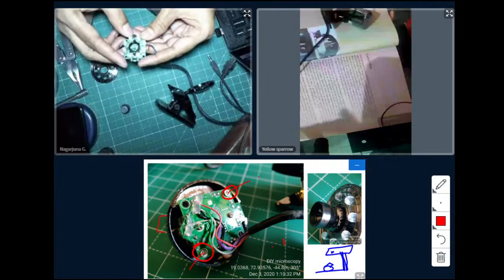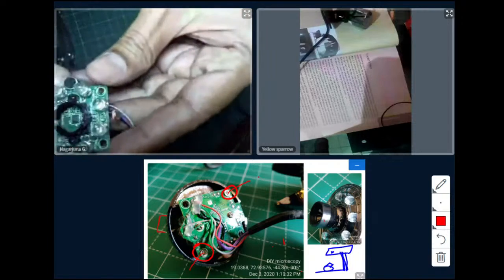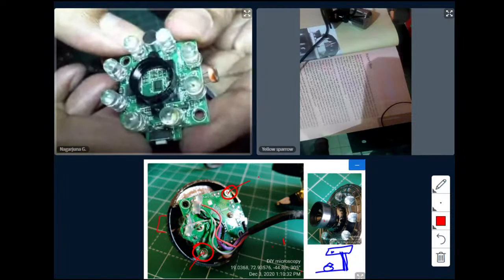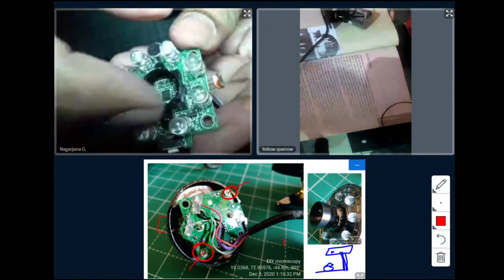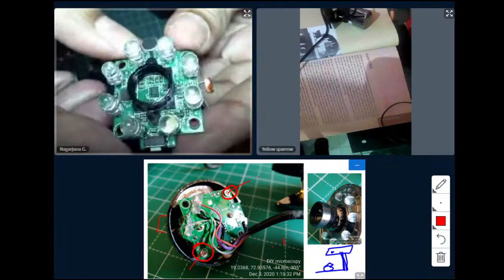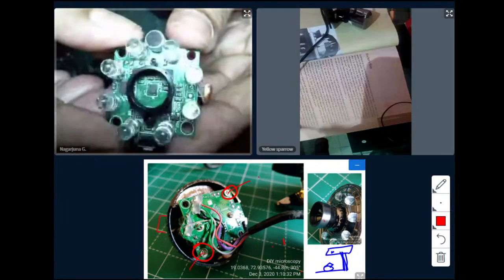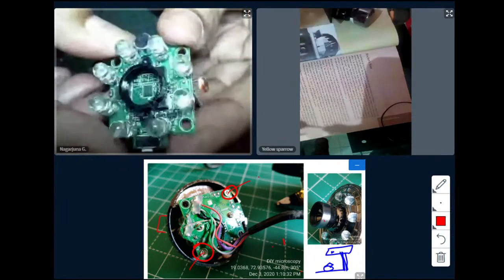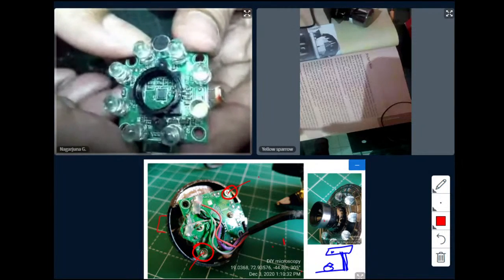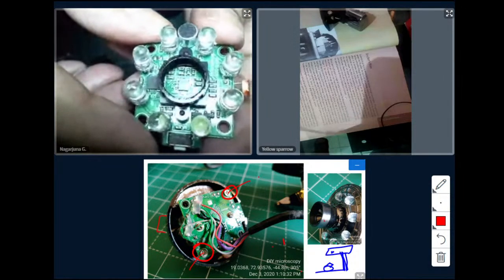Okay. So I think some of the participants are asking, can you see? I'm just keeping it very close to the camera. At the center of the black round ring, there is one rectangular thing on the board, shining. Yeah, I'm just turning it like this so that you can see it clearly in one direction. So that rectangular thing is what is called the CMOS, the sensor.